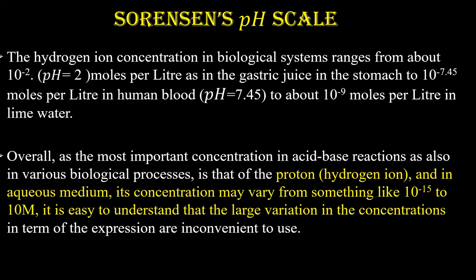The pH scale works in the power of 10. That means each jump in the number is a multiple of 10 in concentration. That is, for example, a pH of 1 is 10 times more acidic compared with the pH of 2, or a pH value of 3 is 10 times less acidic compared with 2, and likewise. Here, Sorensen's scale is given.